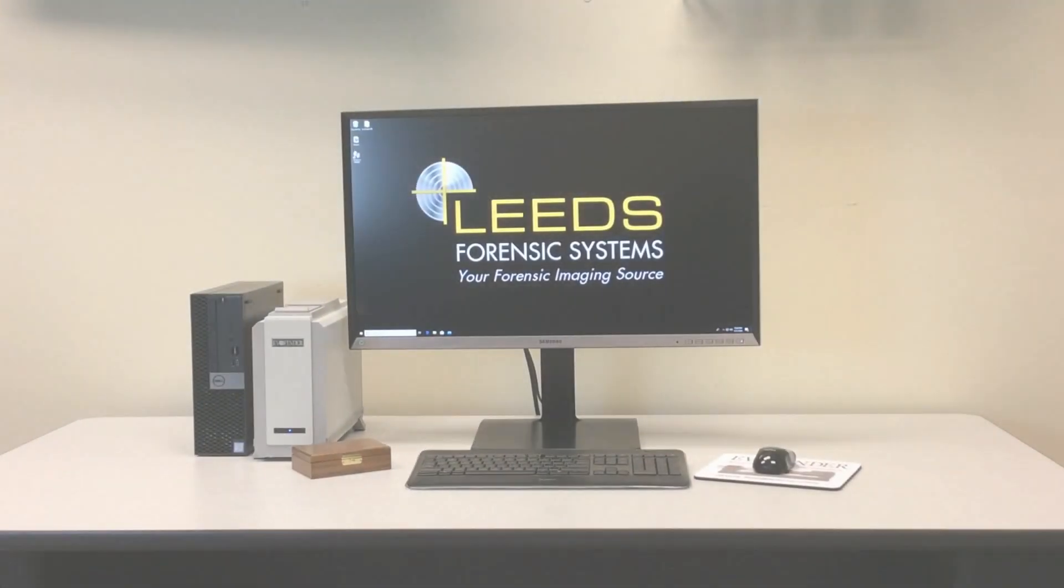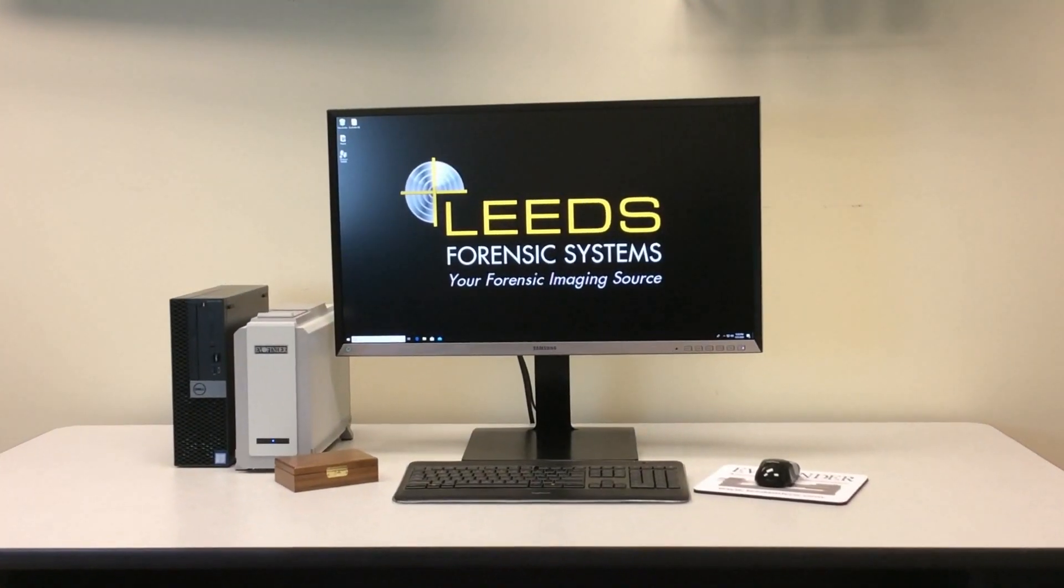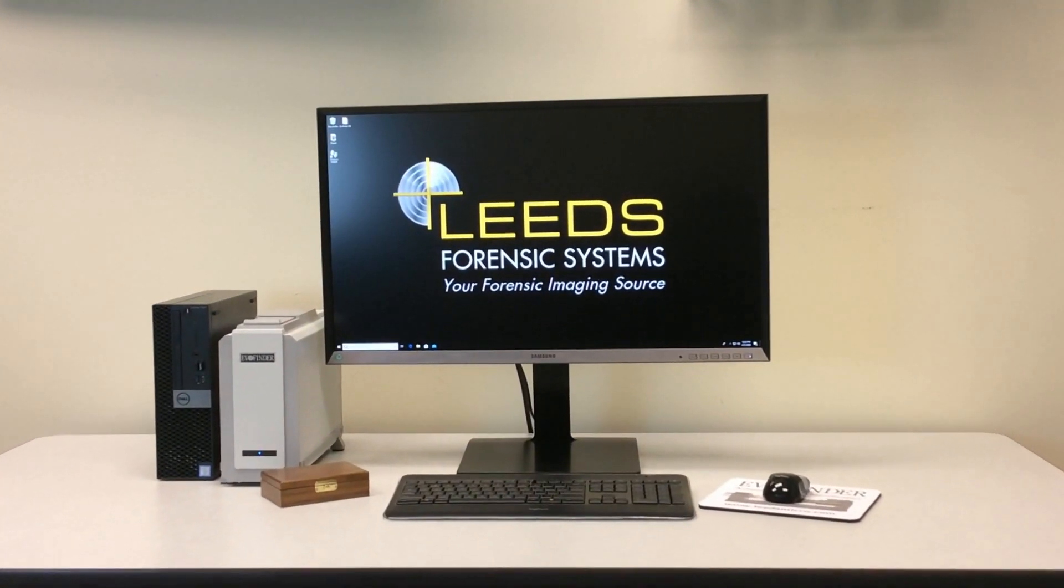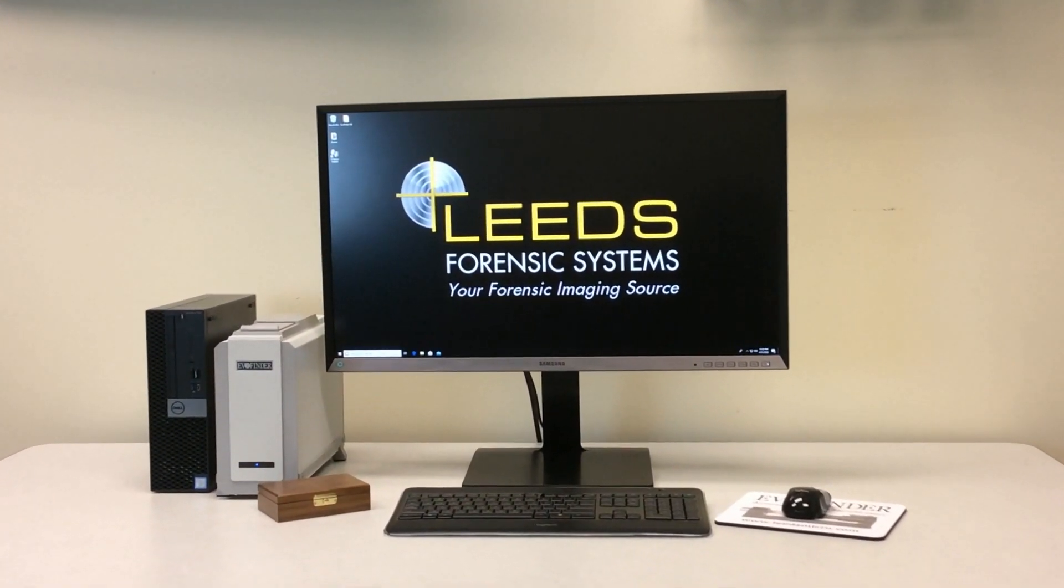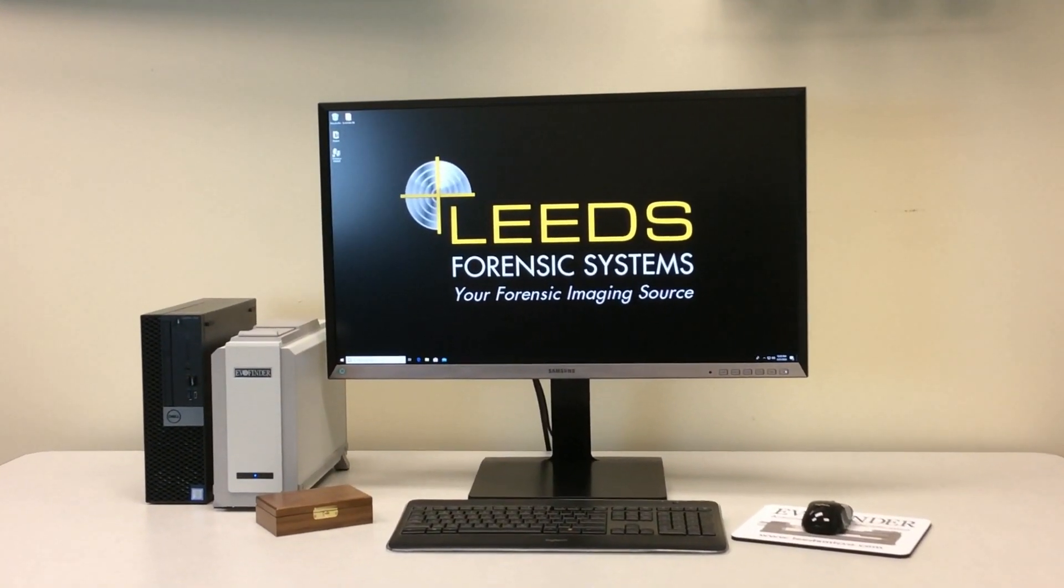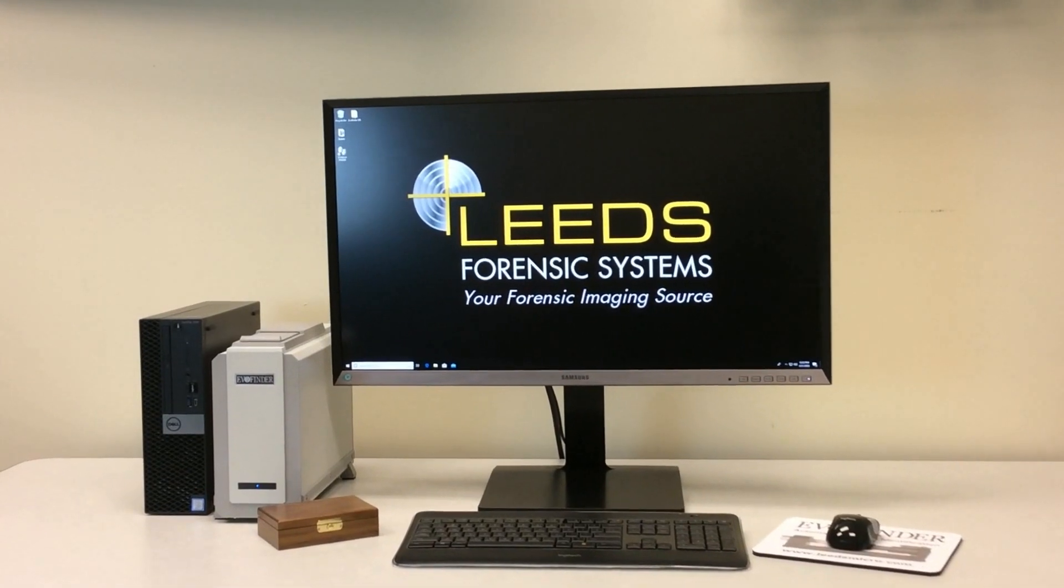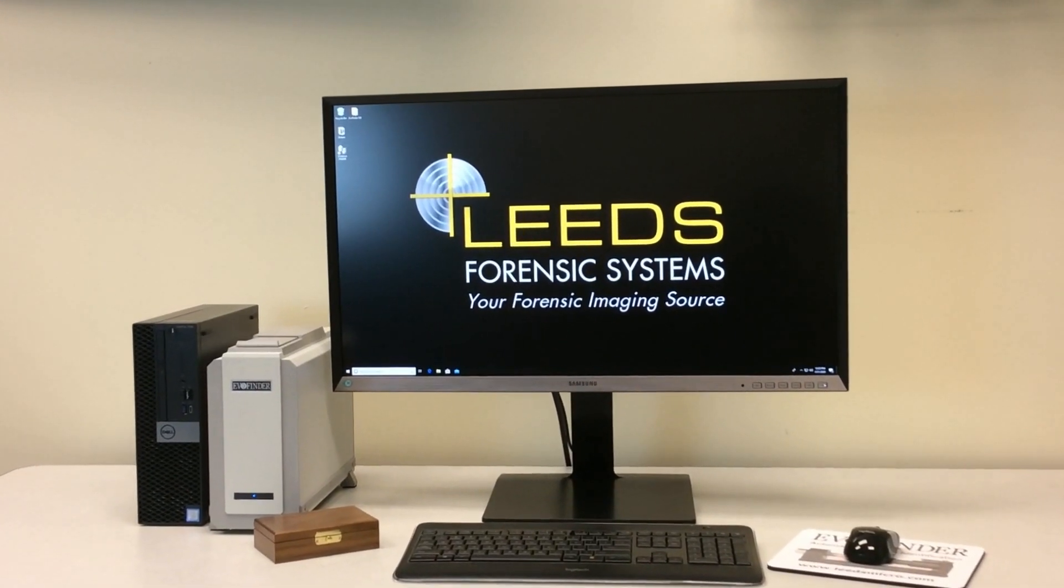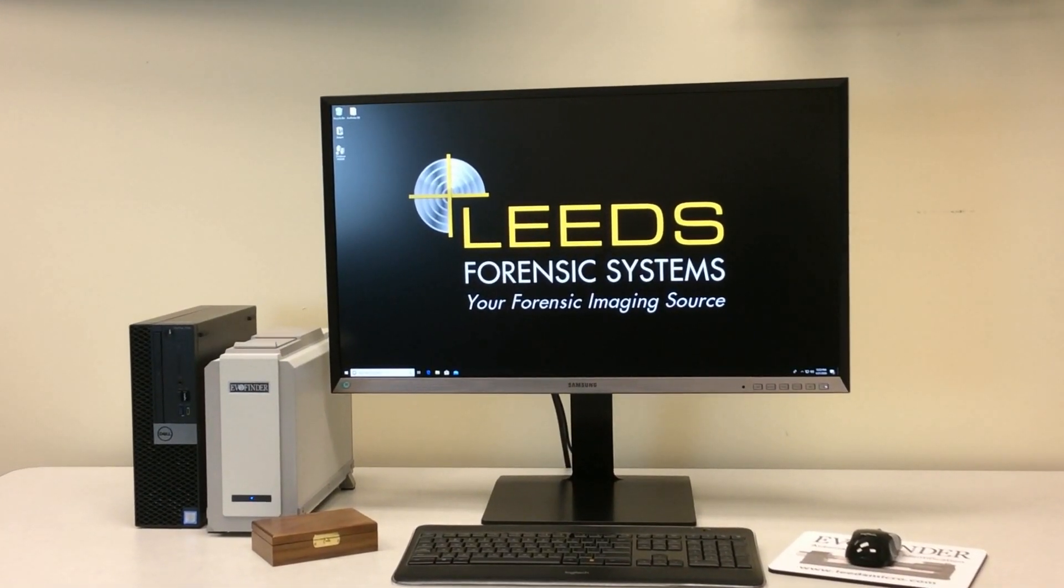The EvoFinder Ballistic Identification System is the most complete tool available for automated ballistic identification and virtual comparison microscopy.